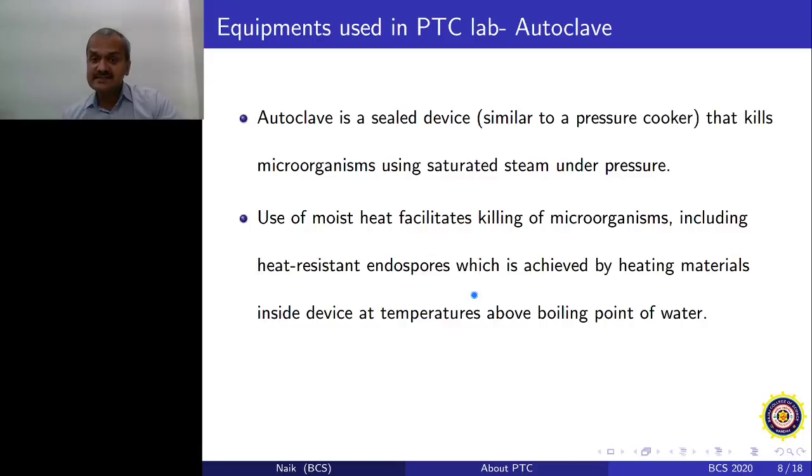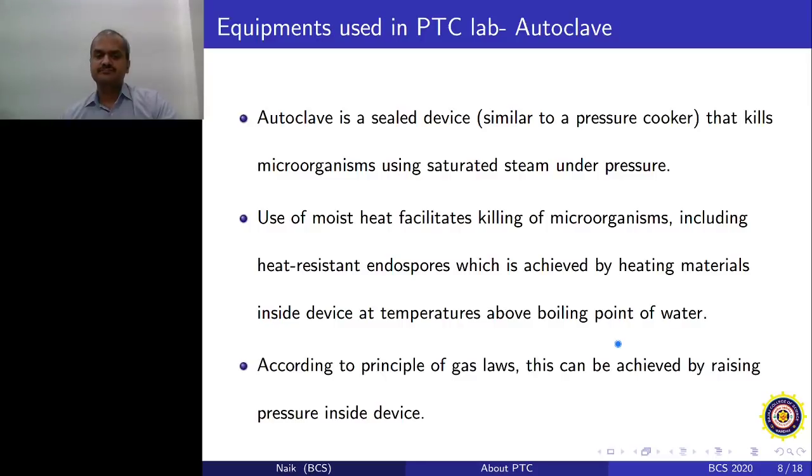But generally 121 degrees Celsius is enough to kill heat resistant endospores and all types of bacteria which are randomly present on the surface of glassware, if at all, because we generally wash the glassware and keep it clean. But if by any random process there are any spores present in your media, outside your media, in your glassware, outside your glassware, all that is going to get killed at such a high temperature.